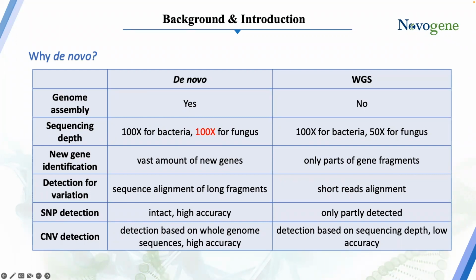Because the goal is a little bit different, and because of the limitations of short read sequencing and some of the biology of bacteria, or microbes in general, where there are some regions that are highly repetitive, you might require a longer read to assemble a de novo genome. So when talking about de novo sequencing, you might move towards one of those third generation platforms where a longer read would allow you to span regions that are highly repetitive, right? Allow for better ability to assemble long reads into contigs and scaffolds.